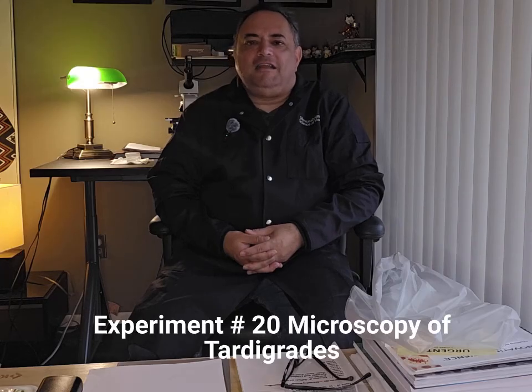In today's episode, we're going to be looking at the microscopy of tardigrades, and I'm going to dedicate this whole video just to looking at tardigrades, also more affectionately known as water bears. And they are fascinating microorganisms. I just get a lot of pleasure from sitting and watching them play and eat while looking through the microscope.